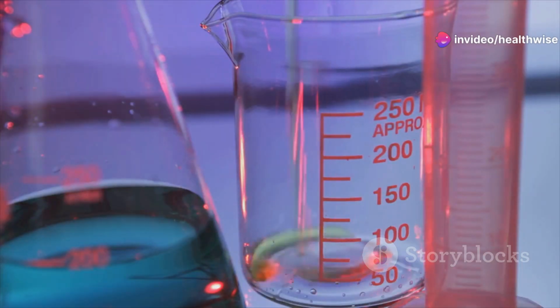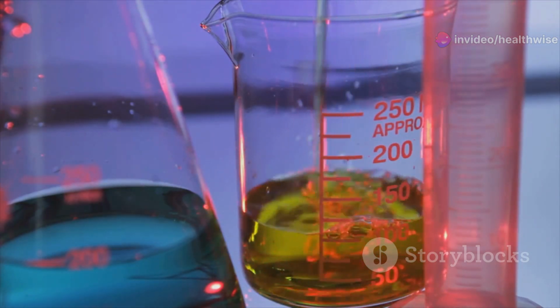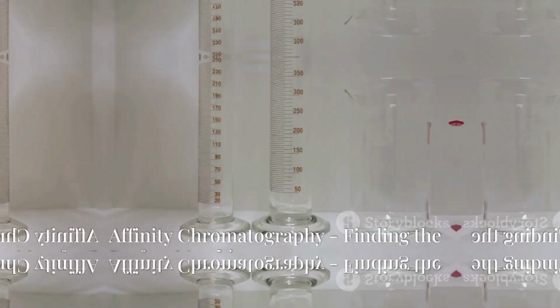So there you have it, Gel filtration chromatography, a simple yet elegant technique that reminds us that sometimes size does matter.